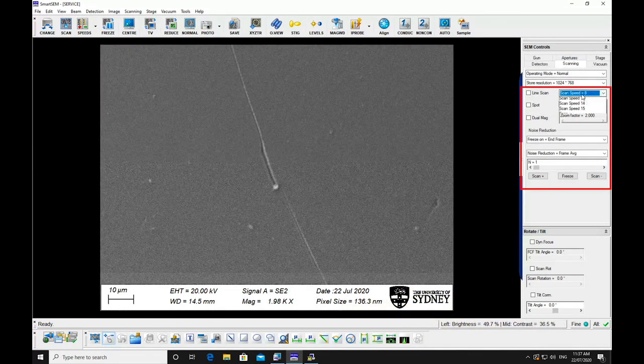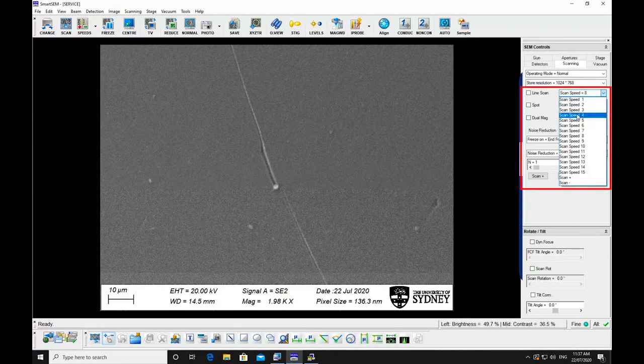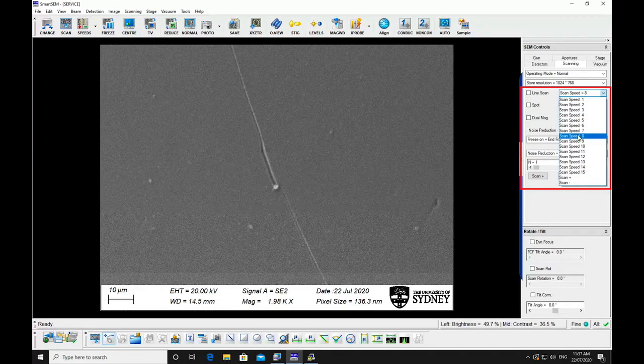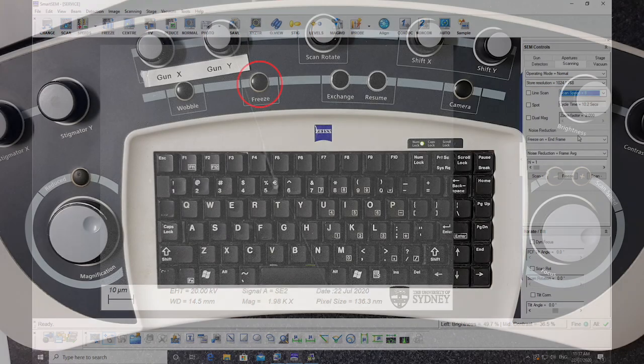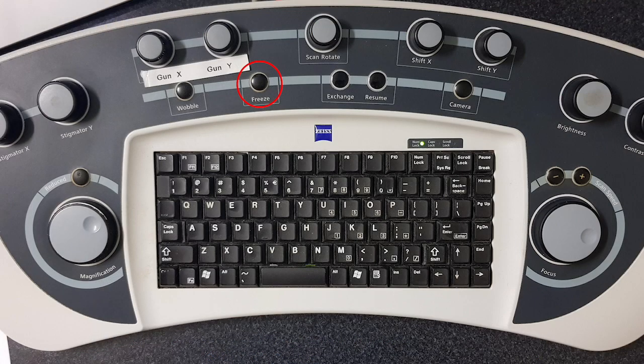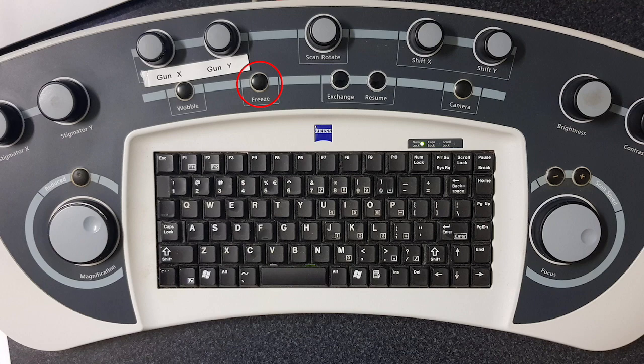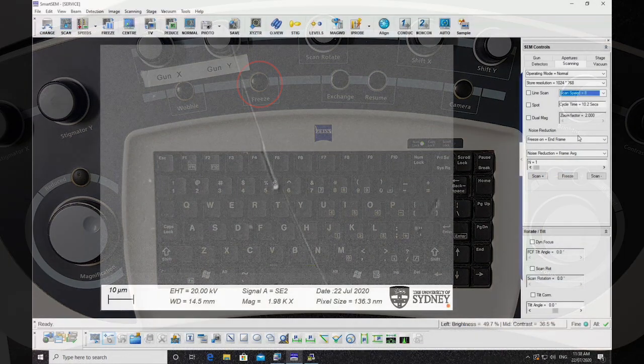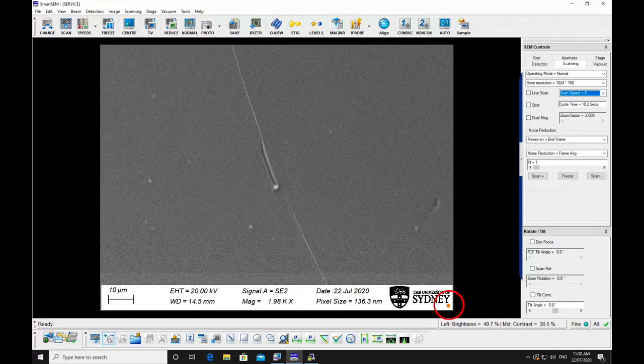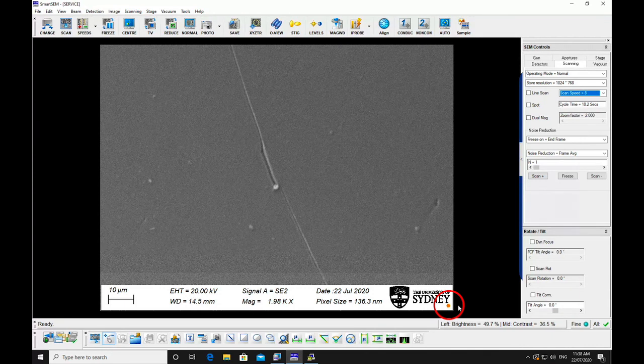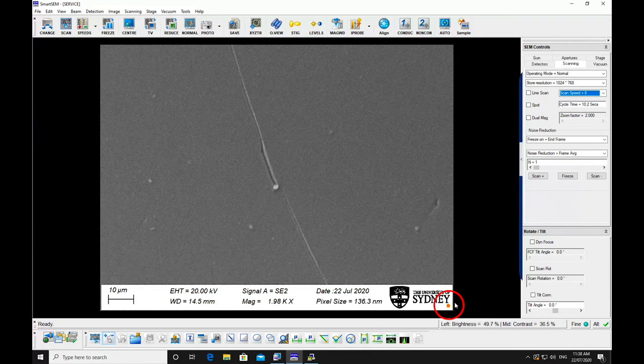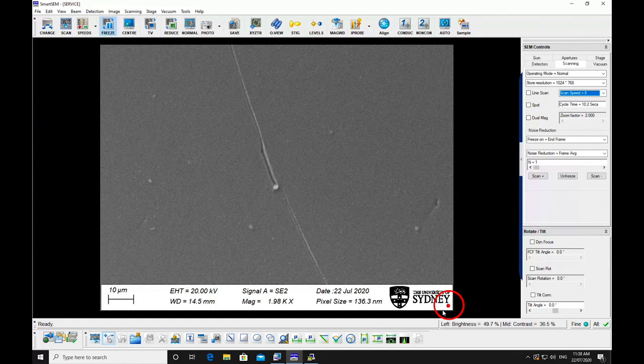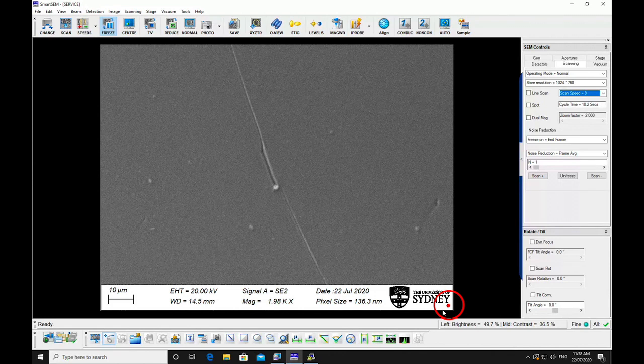Go to scanning in SEM control and slow the scan speed down. Press freeze on the hard panel. An orange light will appear in the bottom right corner. When the frame capture is complete, the orange indicator in the bottom right of the screen will turn red.